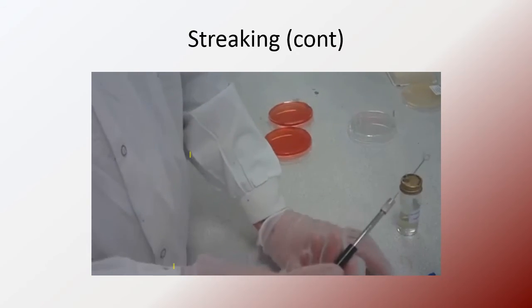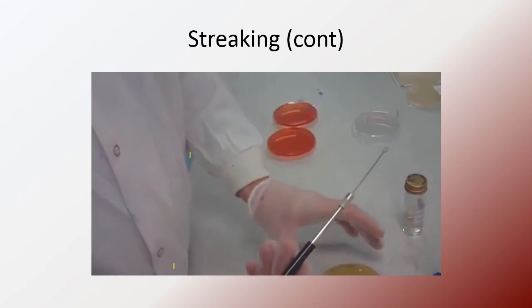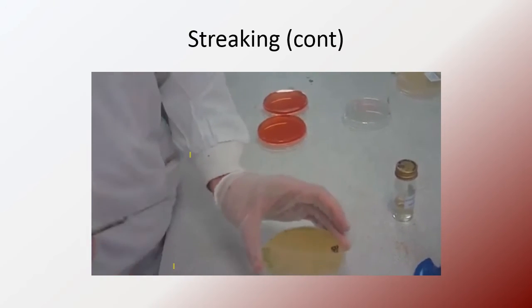Turn the Bunsen burner flame back to safety, and please leave your agar plates on the side to be collected for incubation.